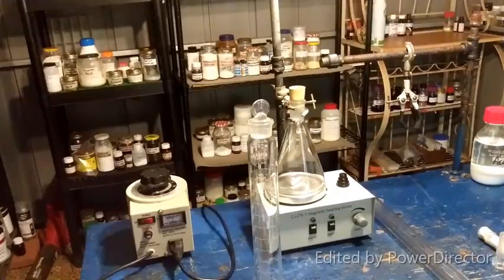It's not absolutely required. The stir bar will act as a boiling stone. I don't want it getting too hot either. When there's no wind, as there obviously won't be in here, it can easily boil water, so that's just too hot.